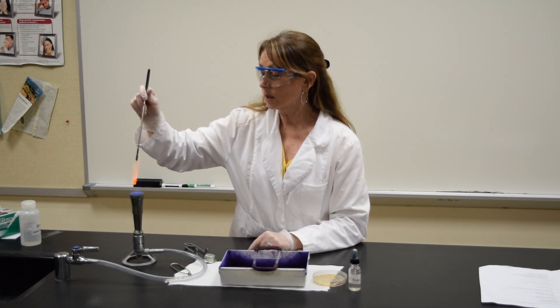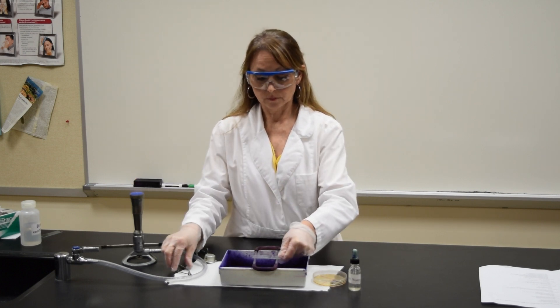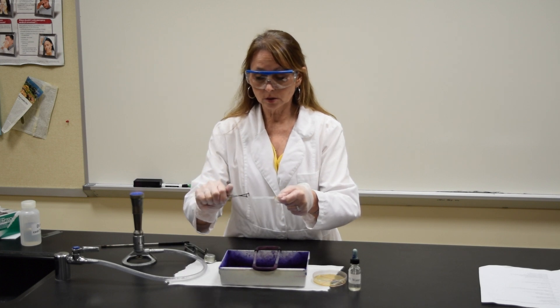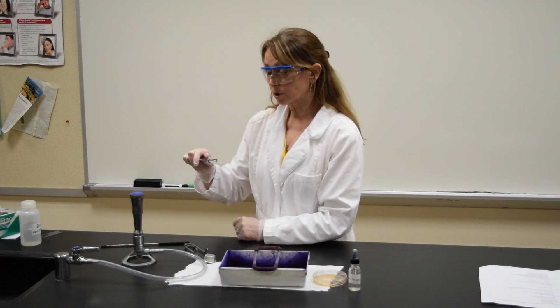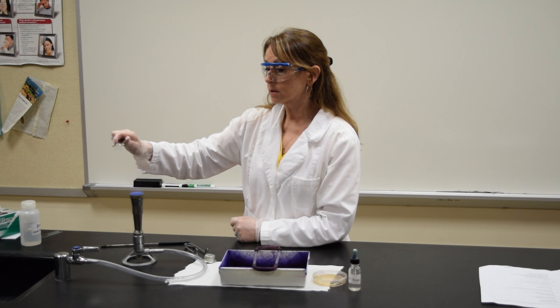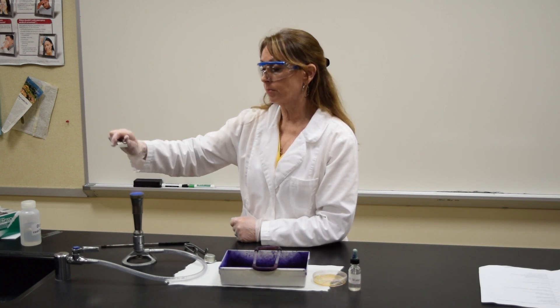Heat your inoculating loop to sterilize it before you put it down on your bench. Then using your slide holder, put the short end of the slide in between the holder and pass the slide back and forth over the flame of your Bunsen burner.